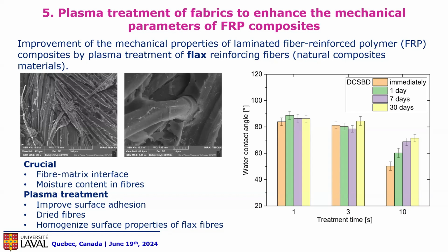Again, a very simple graph: dependence of water contact angle on the treatment time. Water contact angle was measured immediately after treatment, 1 day, 1 week later, and 1 month later. For short exposure times, as I tried to explain, only 1 second, 3 seconds, or 10 seconds, you can see that in the cases of 1 and 3 seconds exposure time, there is no serious aging effect, maybe within the error bars. In the case of 10 seconds exposure time, we were able to decrease the water contact angle much more. And of course, there was also a more significant aging effect, but after 1 month it is still less than in the case of 1 or 3 seconds treatment.